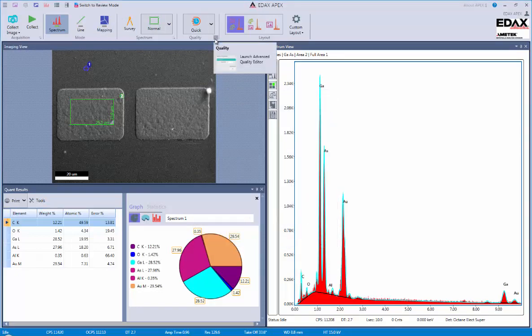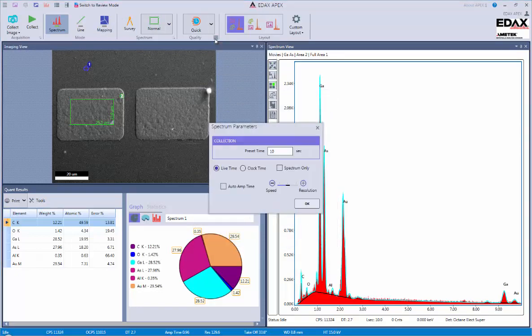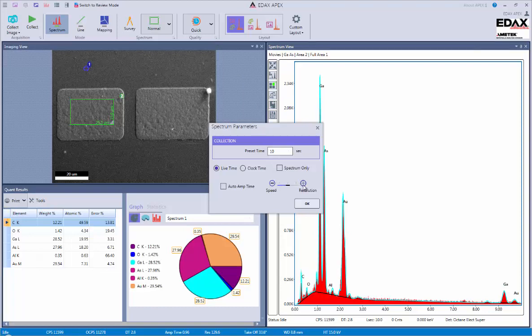Also, for quality settings, we're able to control how long we collect the spectrum for. And also, whether we're interested more in speed, which is higher throughput, or resolution, which is a better quality spectral resolution.